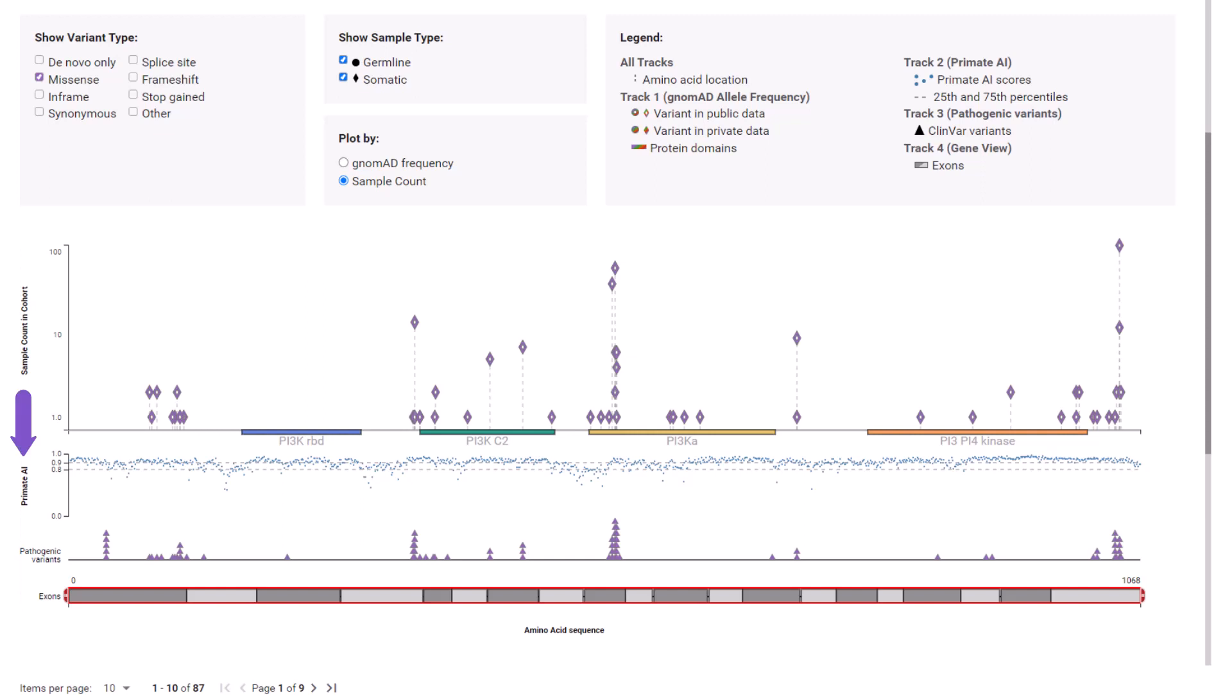The Primate AI track displays scores for potential missense variants. It leverages the dataset of human variants and over 300,000 common missense variants from six non-human primate species. Points above the dashed line for the 75th percentile may be considered likely pathogenic as cross-species sequence is highly conserved. You often see high conservancy at the functional domains.